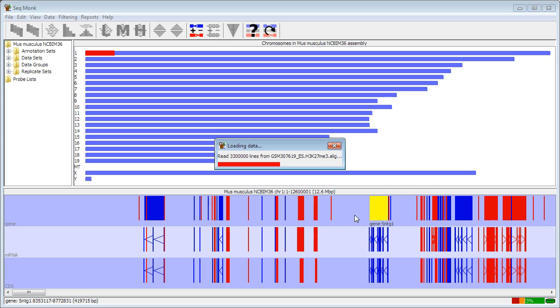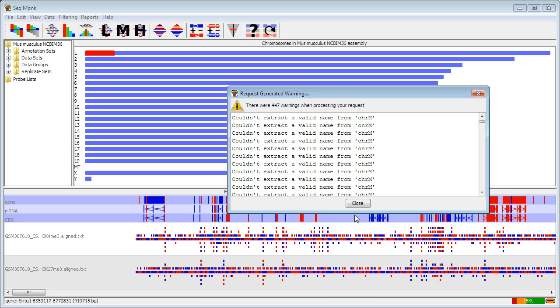When the data comes into the program, it will initially be given the name of the file from which it was imported, and in many cases this is not a particularly useful name to give the file. Things like Illumina's data files will just be named after the lane in the flow cell that they were from, so we'll see how we can rename those files.